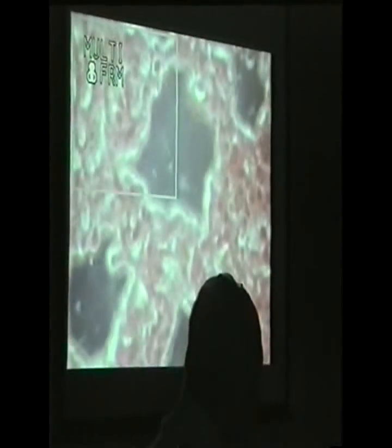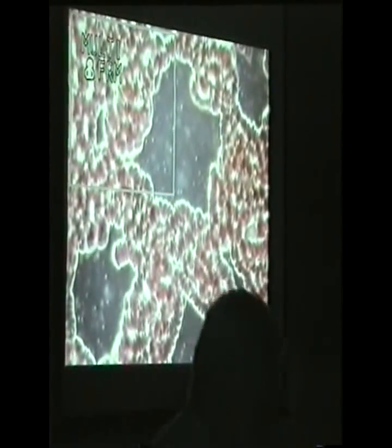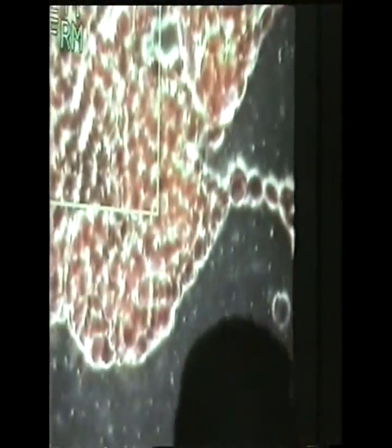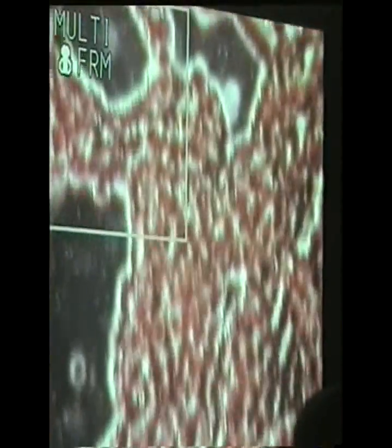This is the blood of a 65-year-old man who feels vigorous and has little to no complaints. Our expectations prove to be true. In this darkfield image, erythrocytes agglutinate. This leaves the door open for the development of common ailments such as heart diseases, hypertension, arteriosclerosis, diabetes, rheumatism and cancer, depending, of course, on genetic predisposition.